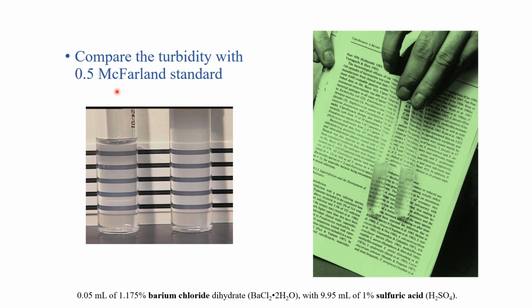After that, we will compare the inoculum with the 0.5 McFarland standard. So this is our inoculum, and this is the McFarland standard. This McFarland standard is a reference standard to compare the turbidity of the inoculum, so that our inoculum is standardized by comparing it with the McFarland standard.